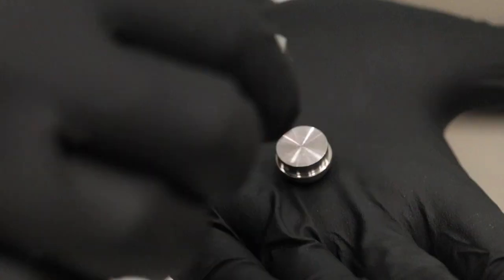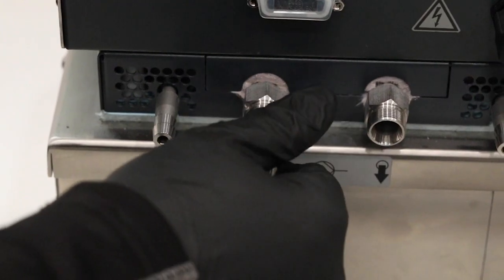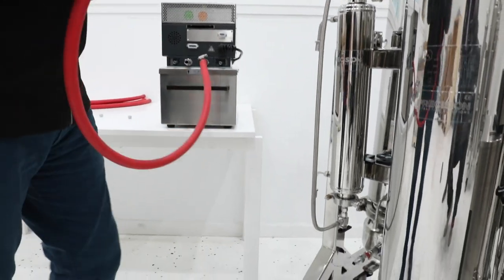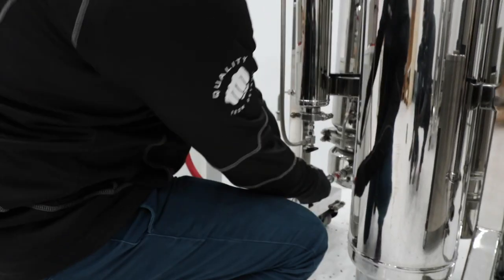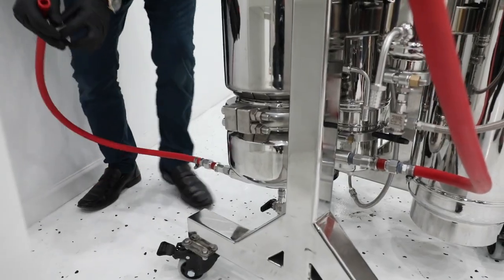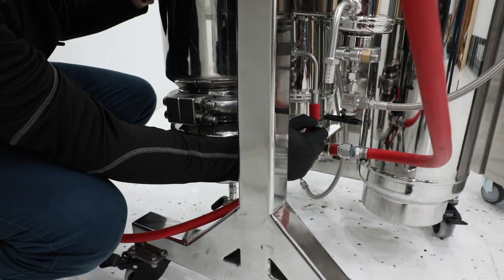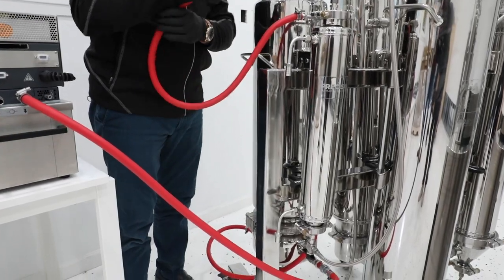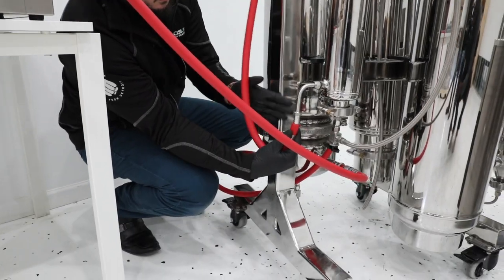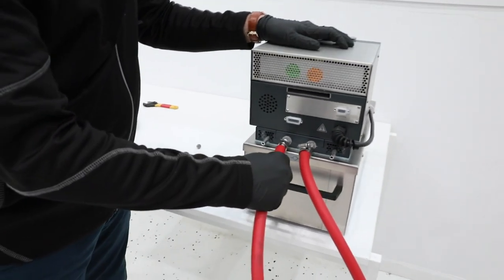Once you've unpacked your unit, you'll remove the plugs on the input and output pumps and attach the supplied hose barb connections. Using the supplied hose, connect the output of the heater to the quick disconnect on the backside of the collection bowl. Connect the front of the collection bowl to the bottom of the collection tank. Now we'll connect the top of the collection tank to the bottom of the molecular sieve. Lastly, we'll connect the top of the molecular sieve to the return side of the heater.